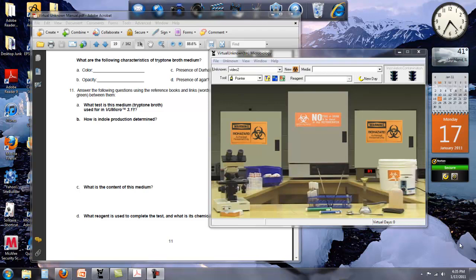Welcome to the microbiology video tidbit on how to use the virtual unknown references.